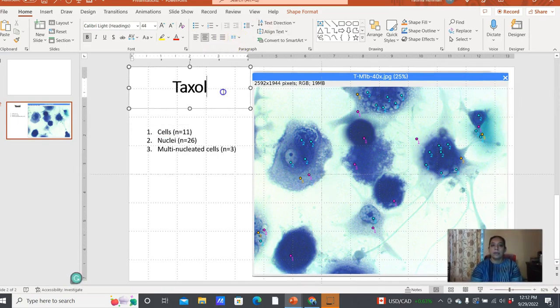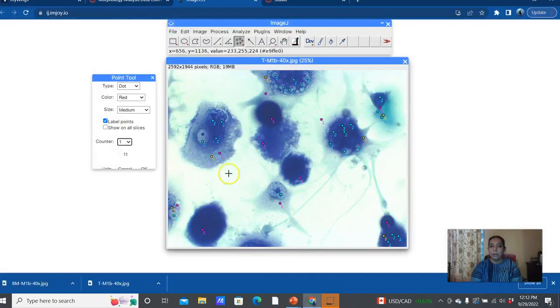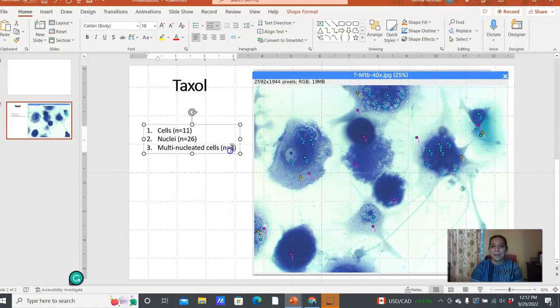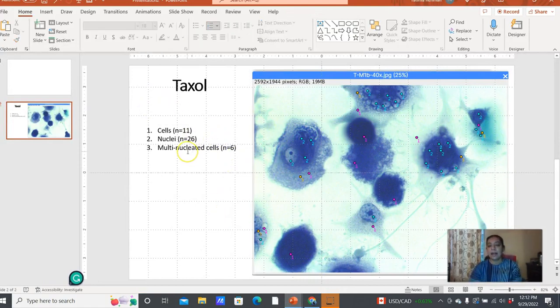Let's go back to the counter and make sure, based on your counts, that you got those correct. 1, 2, 26. Oh, 6. Sorry, it is 6. I didn't read that correctly, did I? So n equals 6, right? So now I can even see that information right up here. You can use this information later on for other things as well.